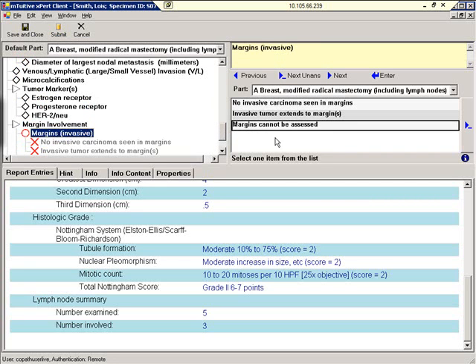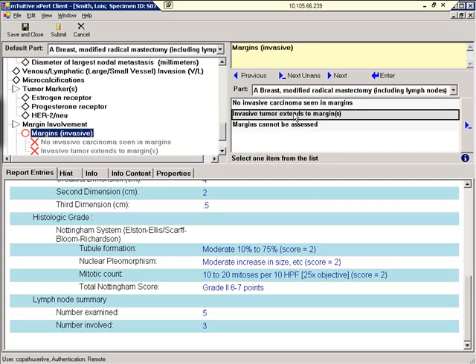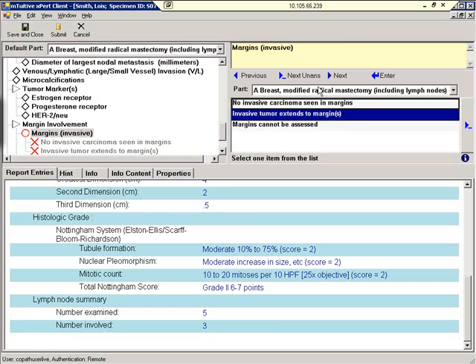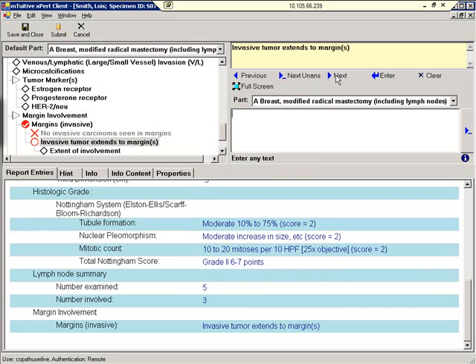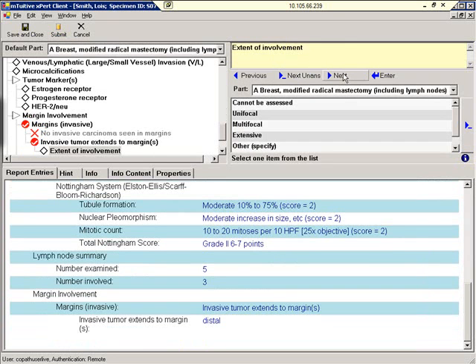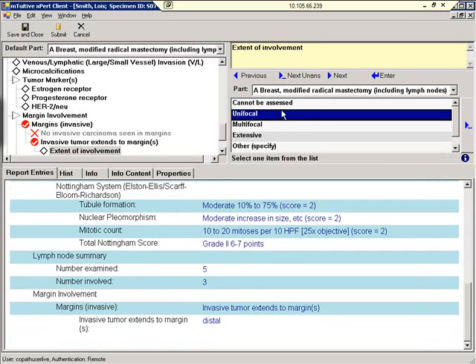Let's navigate down to Margins. We'll select Invasive Tumor Extends to Margins. Here we'll enter Distal. And we'll indicate the extent of involvement is unifocal.